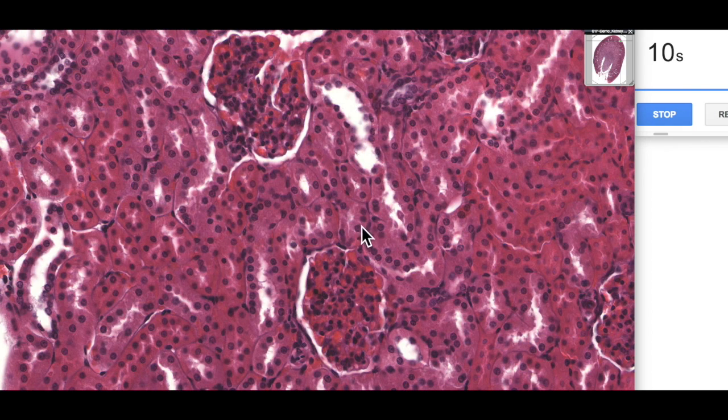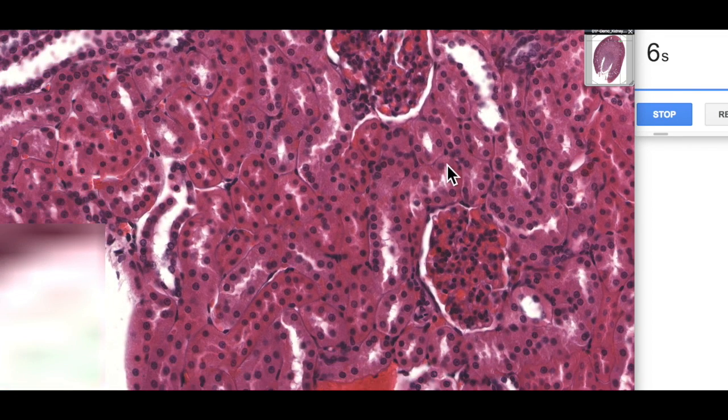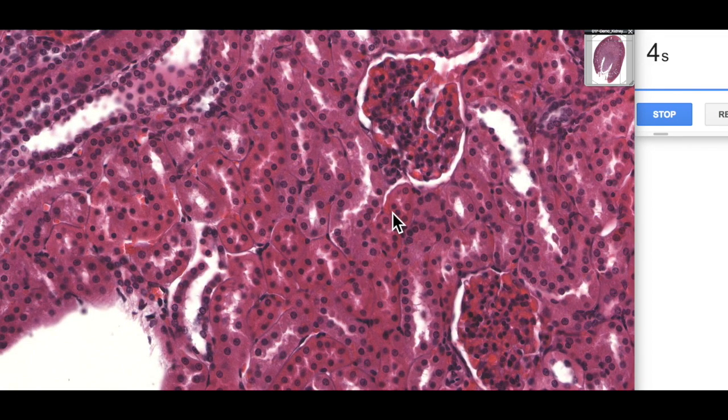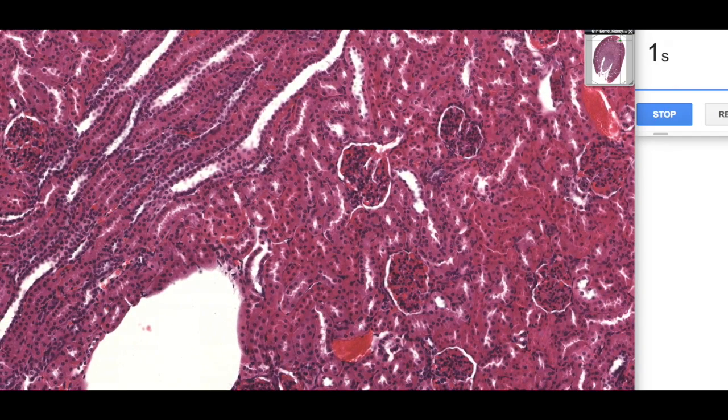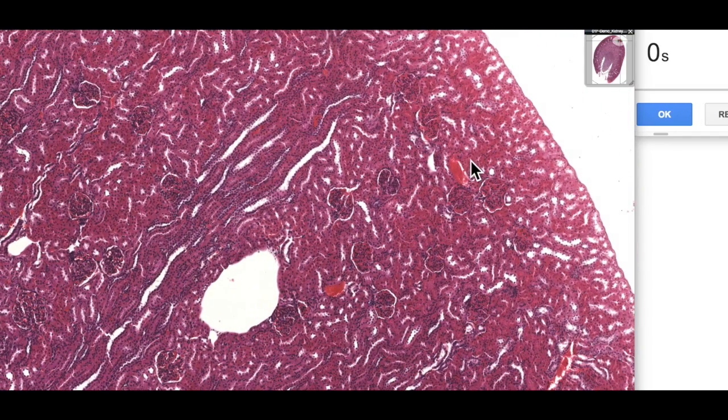Now interspersed in between them are peritubular capillaries and those are the major sort of take home low mag features of the cortical tissue. I hope you found that useful.